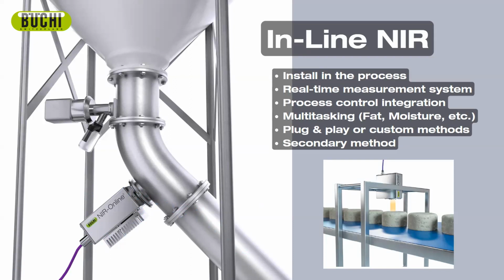The image on the right, you see the light source coming out of it, but essentially it's hitting these cheese wheels and it's telling you what those values are per batch of those as well. So again, online is kind of taking it the next step further where you now have real time data 24/7.